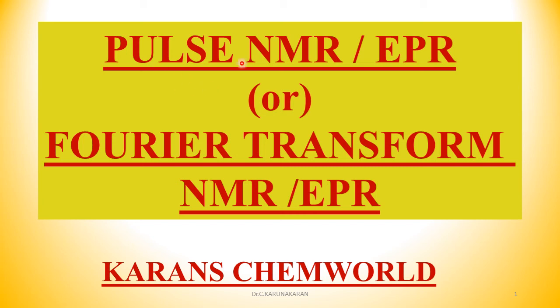This we will study about pulse NMR. It is also Fourier transform NMR. All recent NMR instruments are based on pulsed or FT NMR. Let us see now. It is very easy to understand.